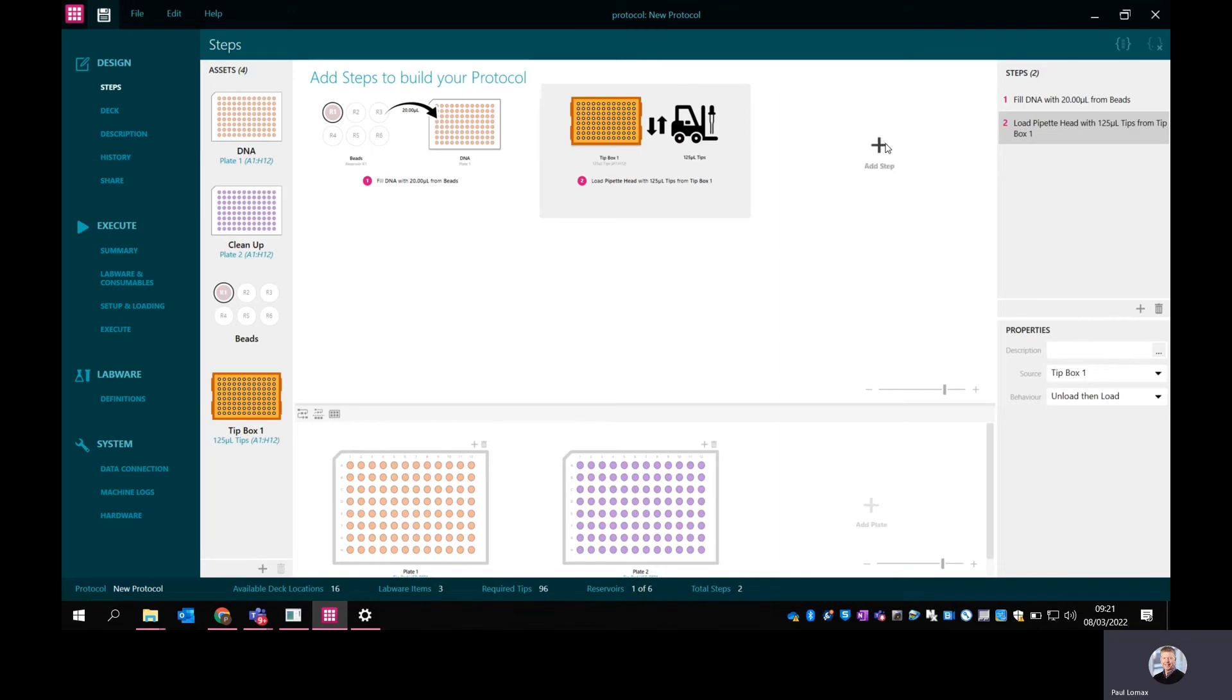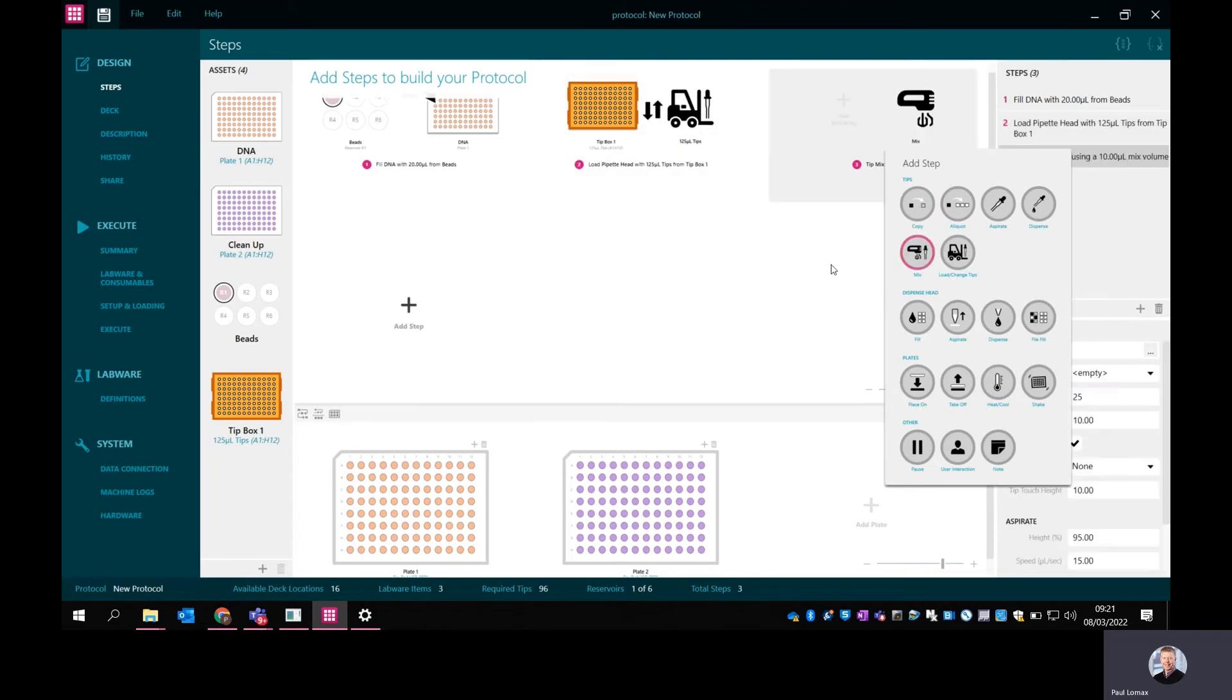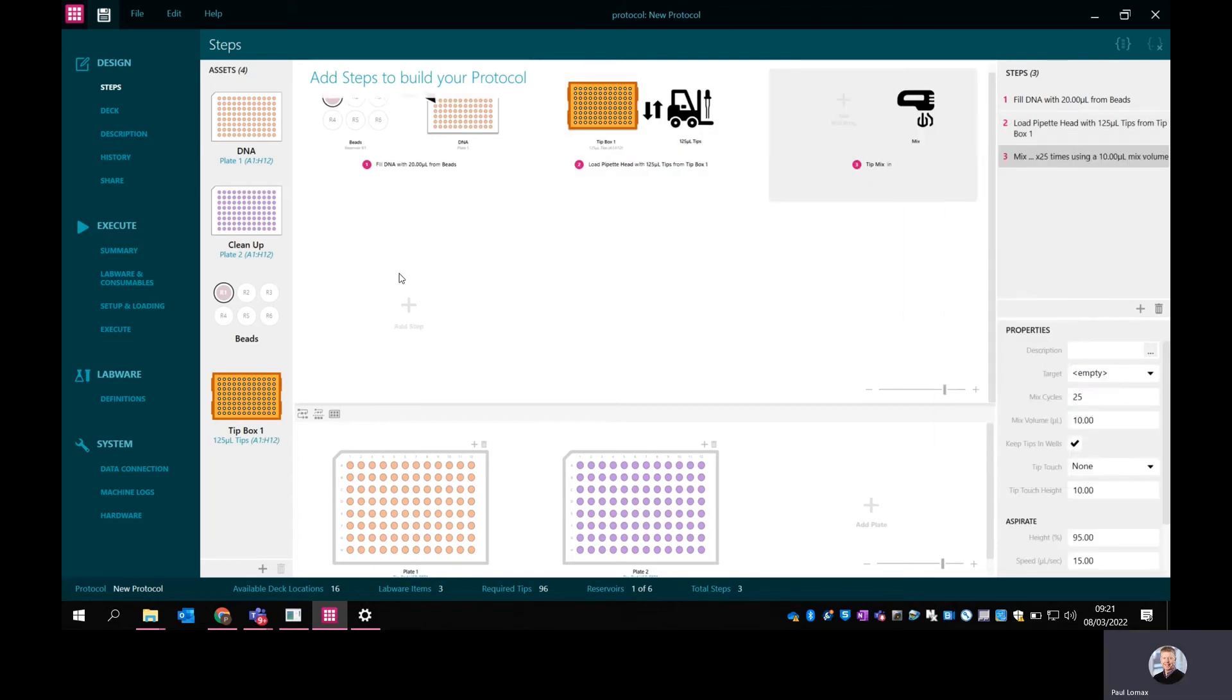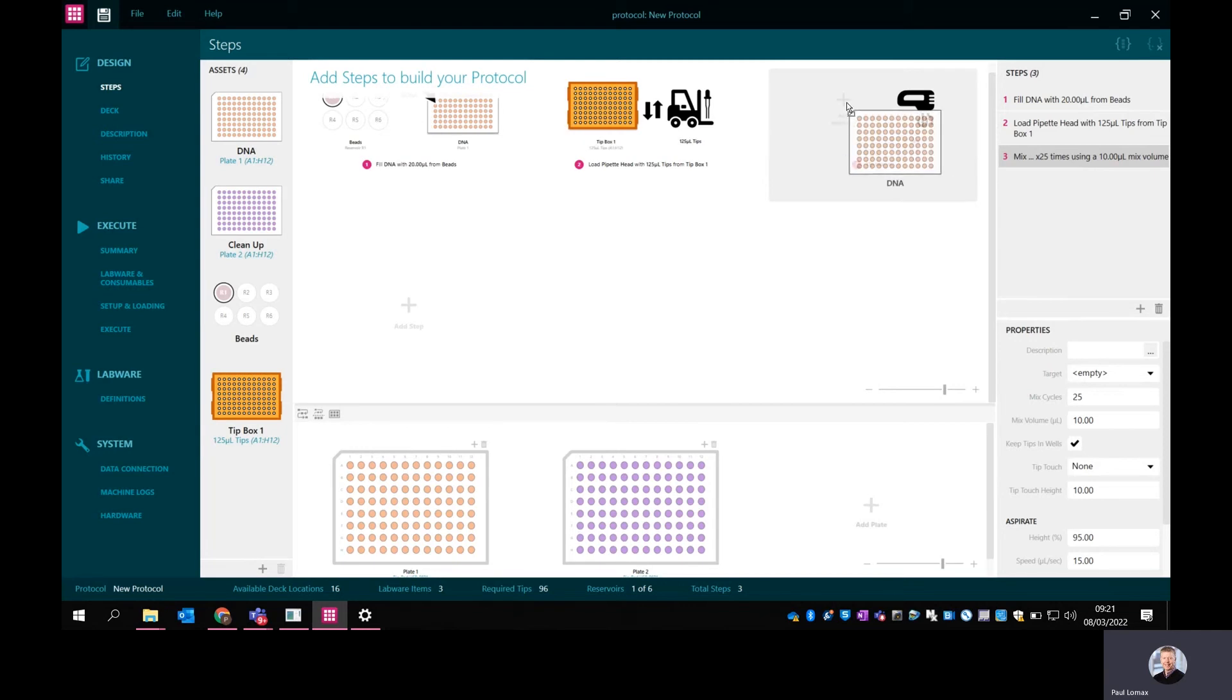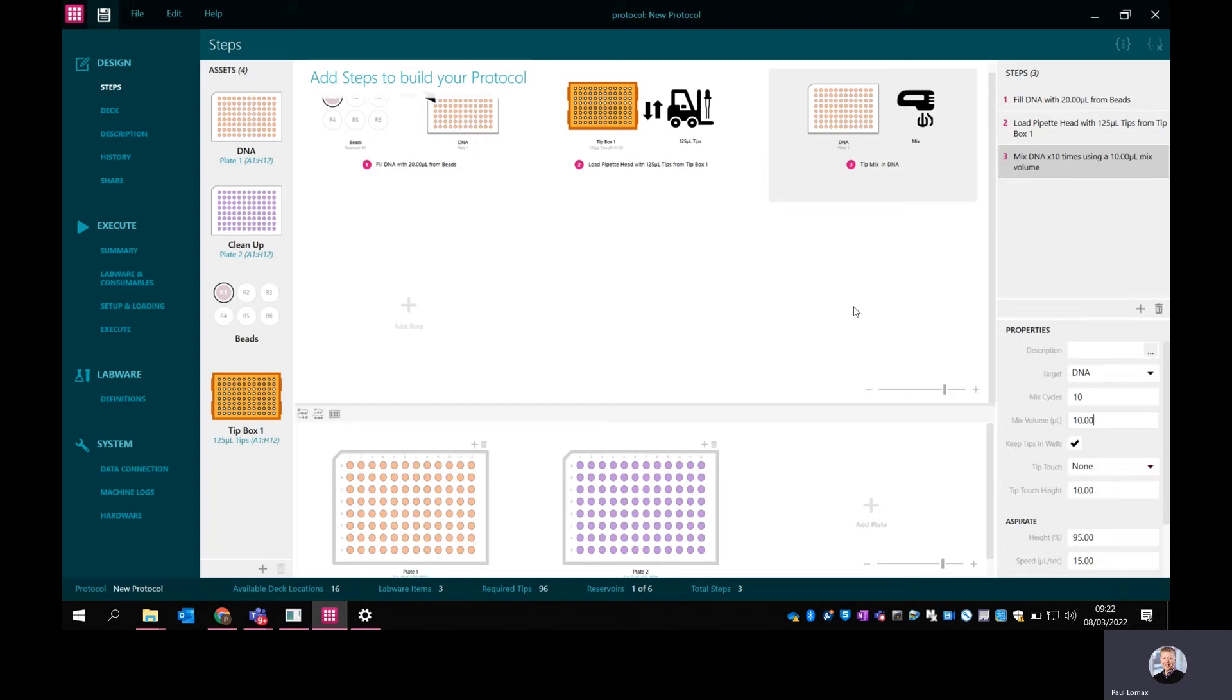Then I want to add a mix step. What I want to mix is what I've just put in the DNA plate. So now I've added my beads, I've loaded some tips, I've done the mix. Again, I can change the volumes here. There's 25 mix cycles - I could change that to say 10 if I wanted a shorter mix. Mix volume I'll leave at 10 for now. You can change the parameters again here. There's a whole host of fine tune settings you can play with, but I'm not going to bother with that for this short demo.